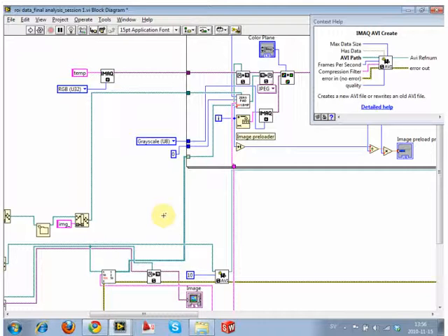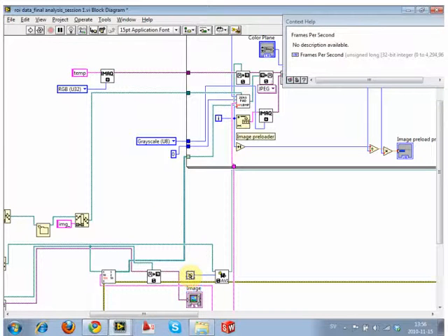And in that situation, you'll probably make this a control. If you envisage using a way to stick all the confocal images together and make a video, it'd be a very small VI to start with. It'd fit just within this region here. But also, you'd make this a control so you can choose it easily. Right now, I'm just hard coding it because this is for a particular data set, but if you're making lots of videos, we put this as a control.